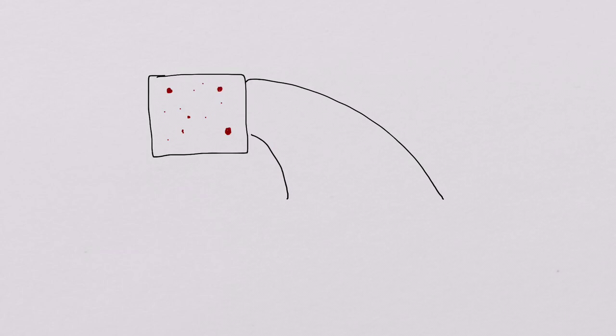So these atoms are all inside this chamber, and we've got an evacuated chamber that you can imagine following sort of a curve. So the idea is that we would open up a little hole here in this chamber, and our particles would be flying out along this curve. Now, they're not necessarily going to take a curved path like that until we impart some sort of force. This is usually done with magnets, and you can do it in other ways, but let's just assume that there is a large force pushing our particles, in this case at least, downward. So the particles will now be coming out of this chamber and will be pushed downward by that force. So that's really the very overly simplistic basics that you need to know.